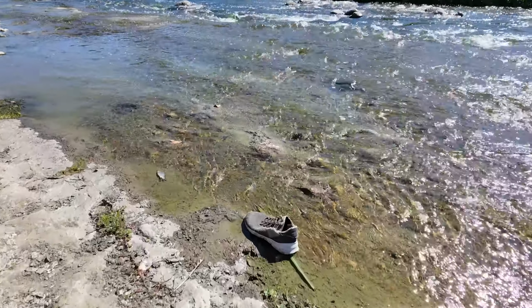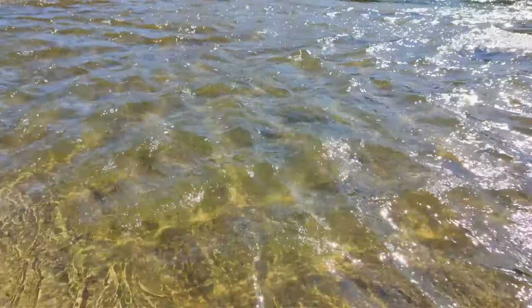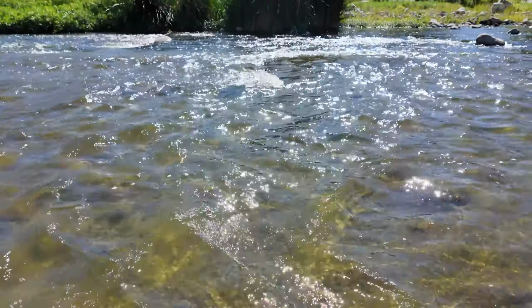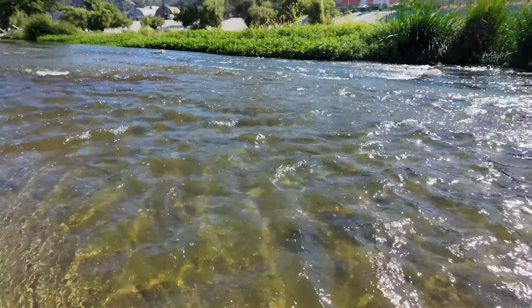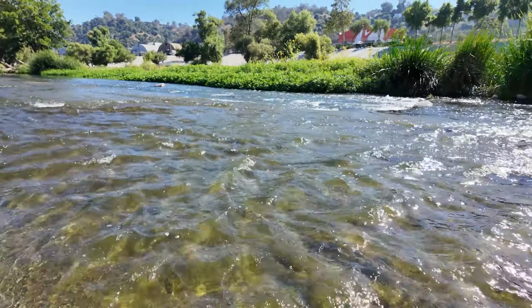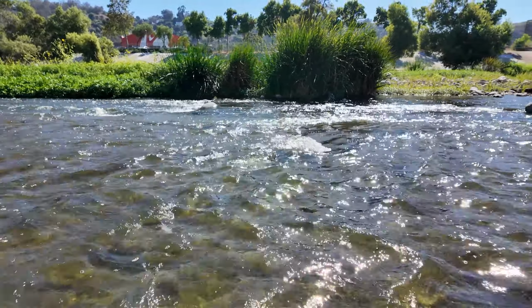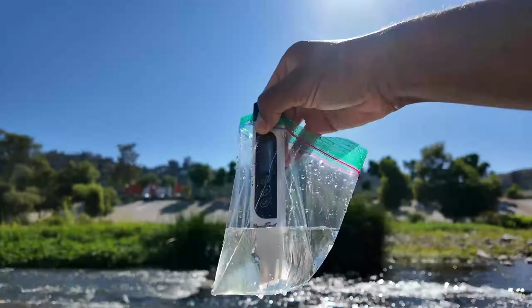Well, that doesn't belong there. So we're about 50 yards further downstream, and you can see that the water, again, looks more clear. Still a pretty strong current in this area. Let's see if it's enough to have a cleaner reading from this probe, or is this going to be much of the same as we had before?